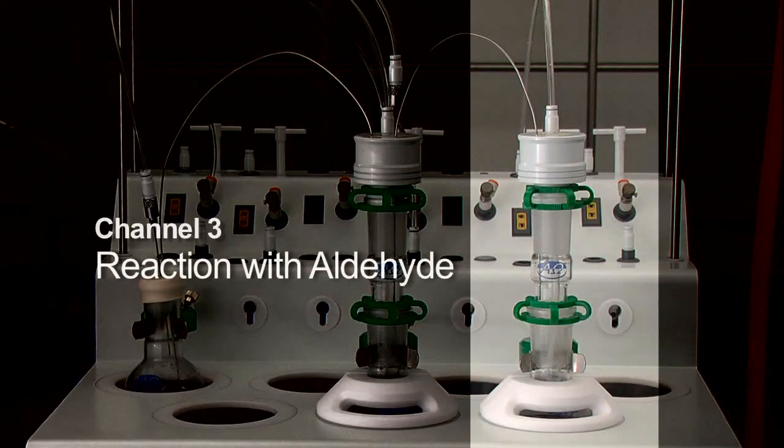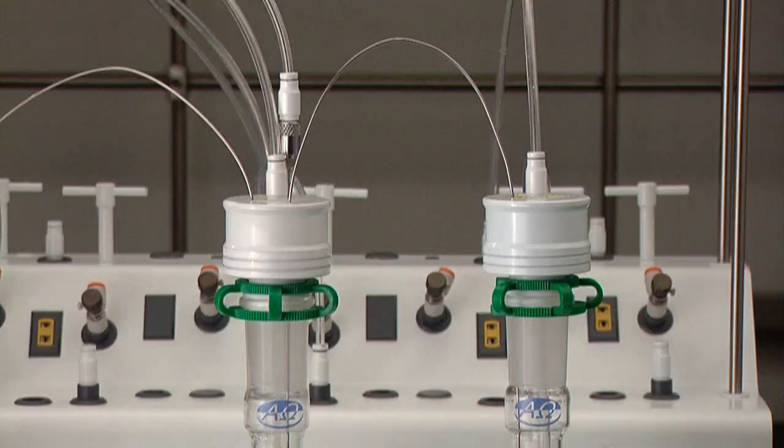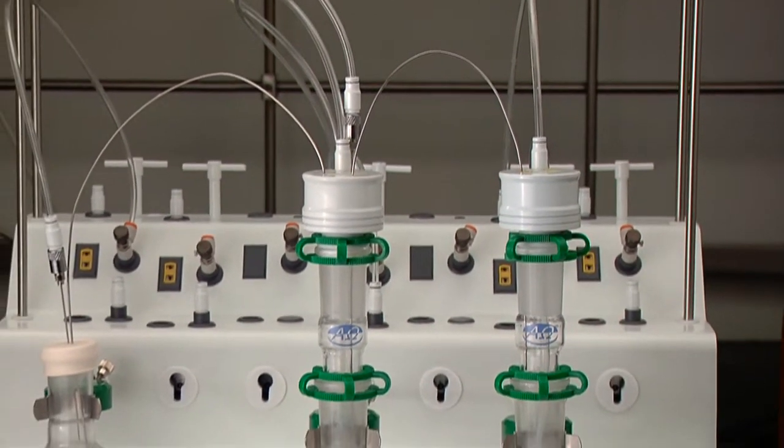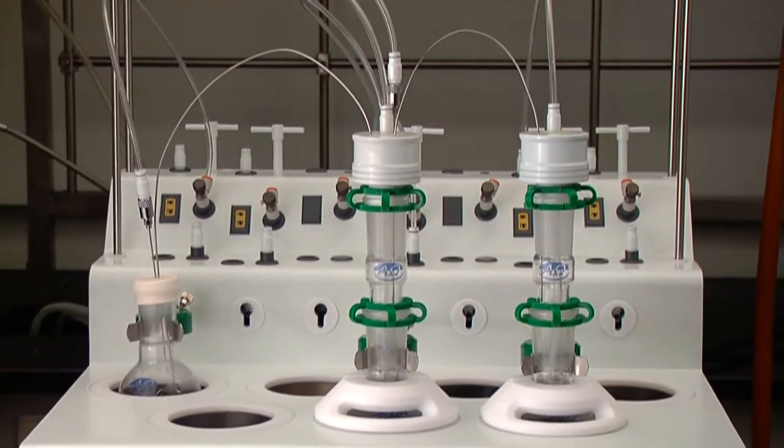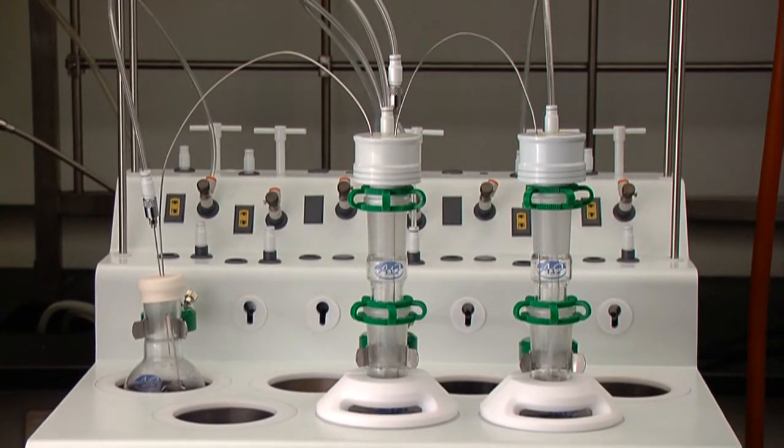We conduct the substitution reaction at minus 20 degrees in channel 3. After that, we transfer the Grignard reagent in drops from channel 2 to channel 3 to complete the reaction.